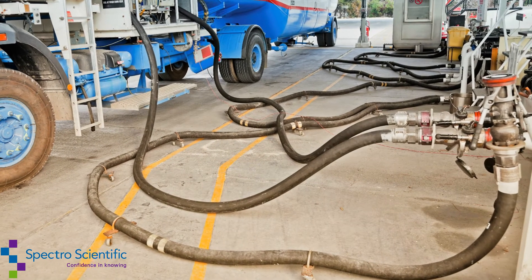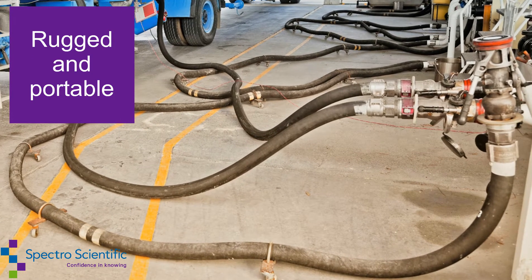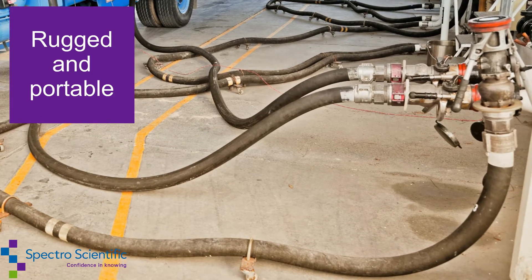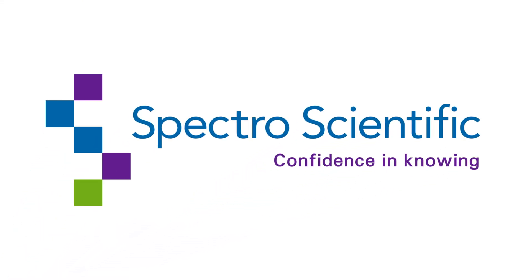The InfraCal 2 is rugged and portable, making it easy to bring the analysis to the measurement site or test samples remotely. The InfraCal 2 from Spectro Scientific — confidence in knowing.